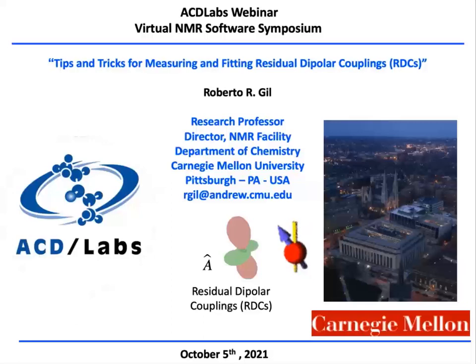And I'm really impressed by the ability of the ACDLabs software to handle the measurement of RDCs and fitting the NMR RDC data to structures. Well, let's move on with my talk.